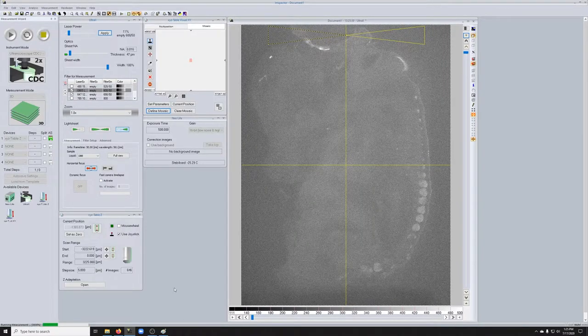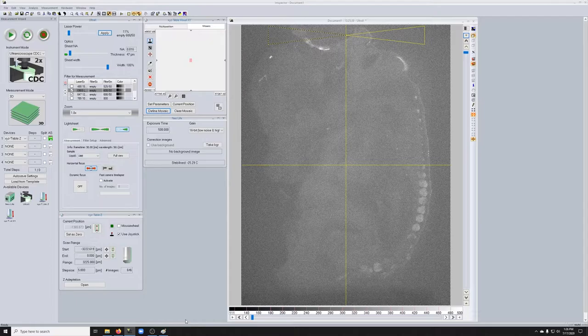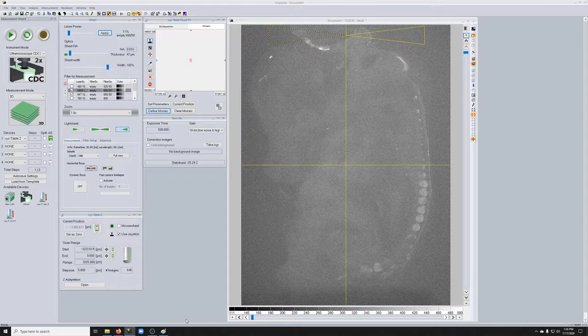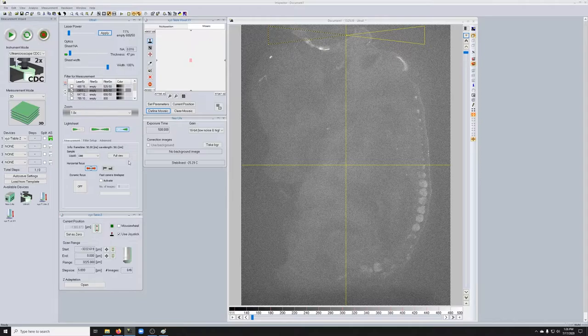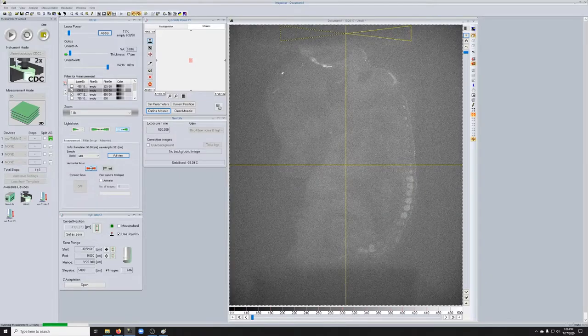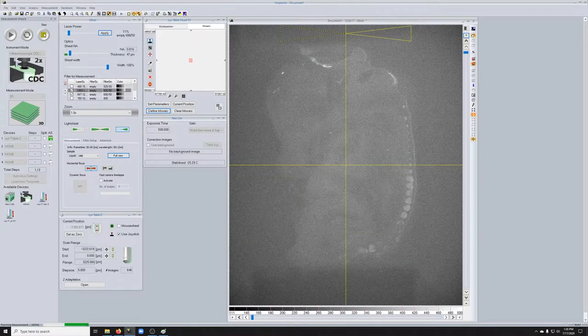Now let's say that you look at this and you're not happy with how you cropped it. You want to go back. And so the way you do it to go back is unfortunately it's not a button near this. It's a button in a completely different place over here, where if you click full view, and then you click video again, you get the uncropped version.